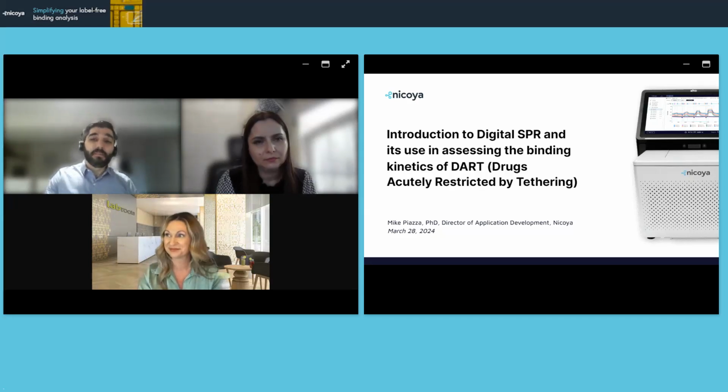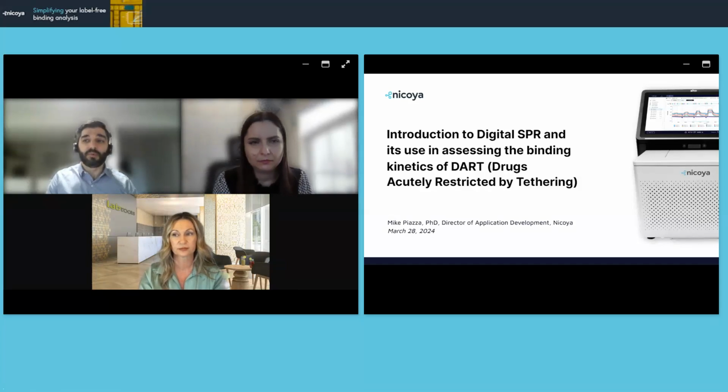Yeah. So the cartridge itself is loaded with a cartridge fluid. It's a very, very viscous solution, which has very minimal evaporation. Over a 24-hour period, the evaporation is on the order of about 50 to 100 microliters, and we load about 8 milliliters of that. So it's very minimal. The samples are loaded into this fluid, which makes evaporation of our actual samples negligible. So we can keep those droplets on there for days without seeing any measurable evaporation.